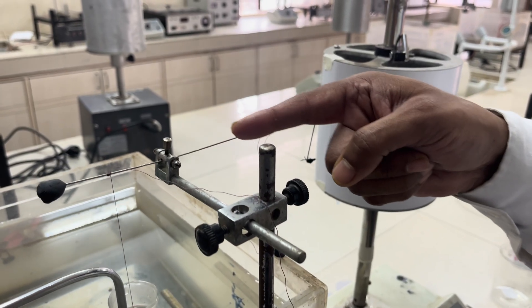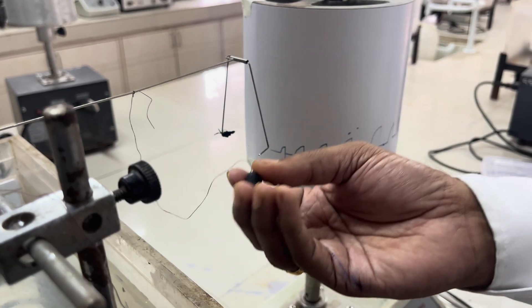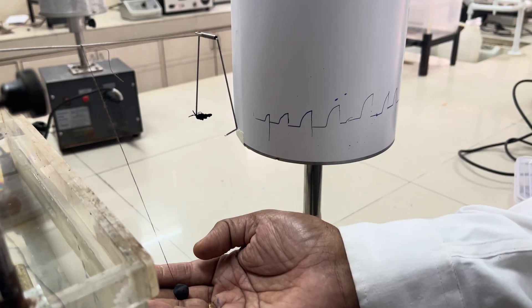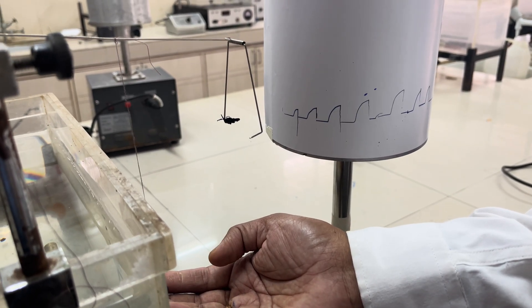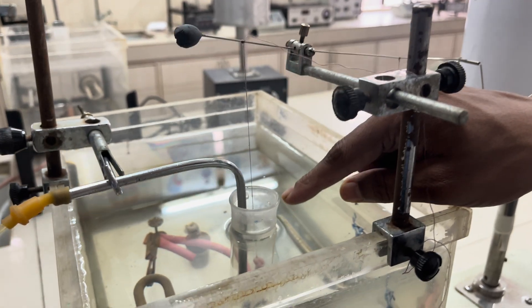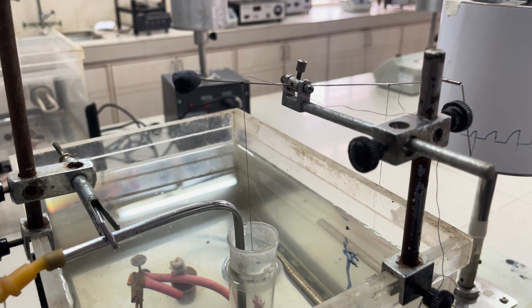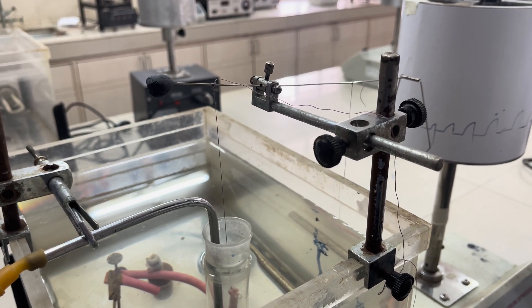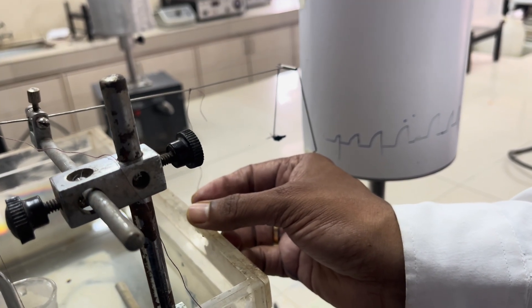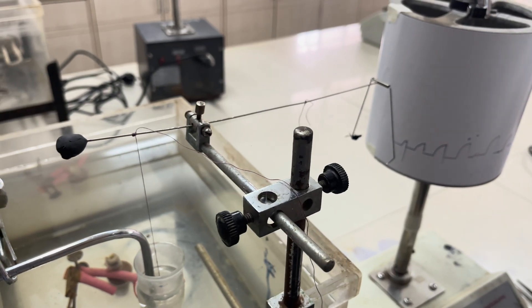Once you have tied the tissue to the lever, attach a small weight and lift it so that a stretching is developed in the tissue. This stretching produces relaxation of the tissue. After 20 minutes, pull the weight again and observe that the lever is in a horizontal position.